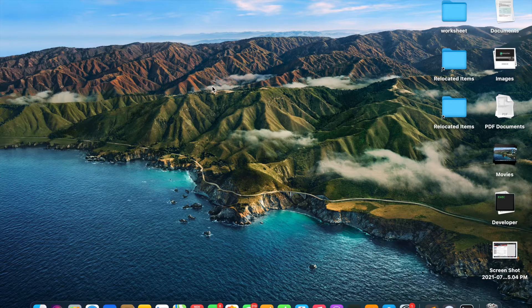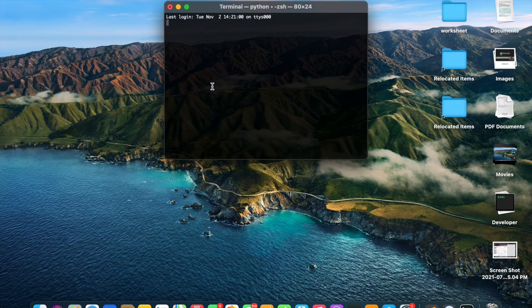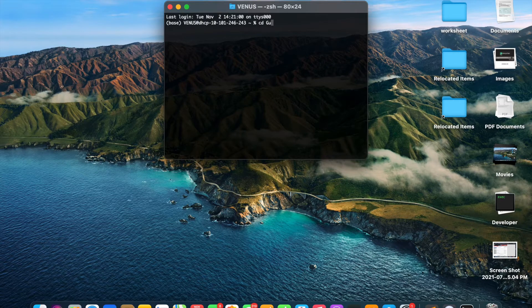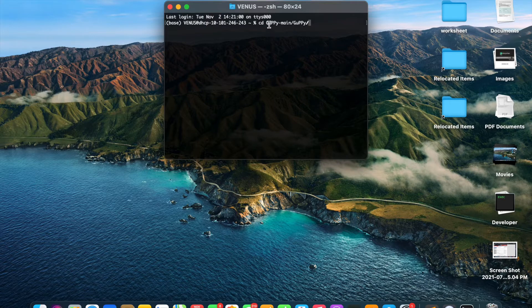To open Guppy, first we will open the terminal if using Mac or Linux, or the Anaconda prompt window if using Windows. After opening the terminal, change the directory using the cd command to the Guppy folder. The folder has Guppy main as the first folder, and inside it there is one more folder called Guppy, so I will change my directory to Guppy main slash Guppy.